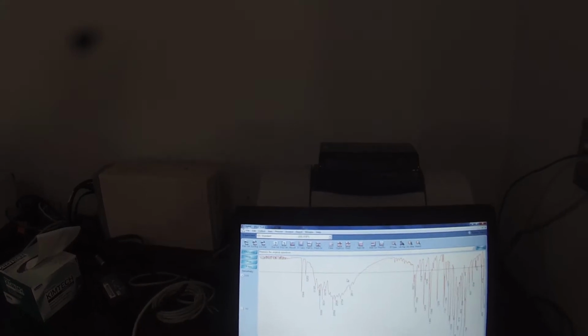We know that we care about that peak, so I'm going to set it below that threshold. Right. There are a lot of peaks. I'm going to go ahead and replace it anyway. Right. So some of these little peaks in the middle we probably don't really care about. So all these peaks above 3,000, these four, I'm going to move those so they're kind of in one place. Those peaks are all sp2 carbon-hydrogen stretches.